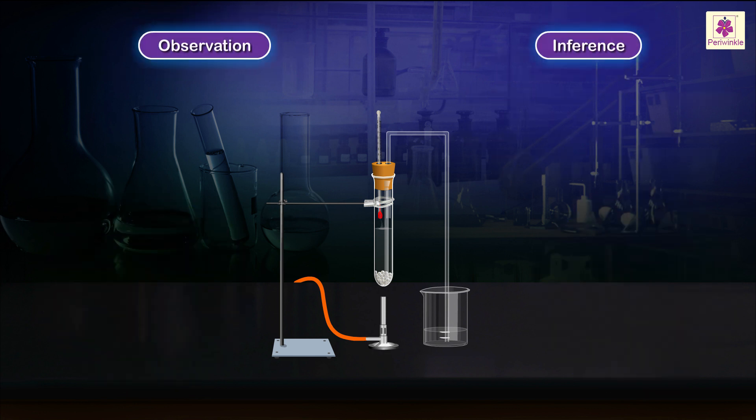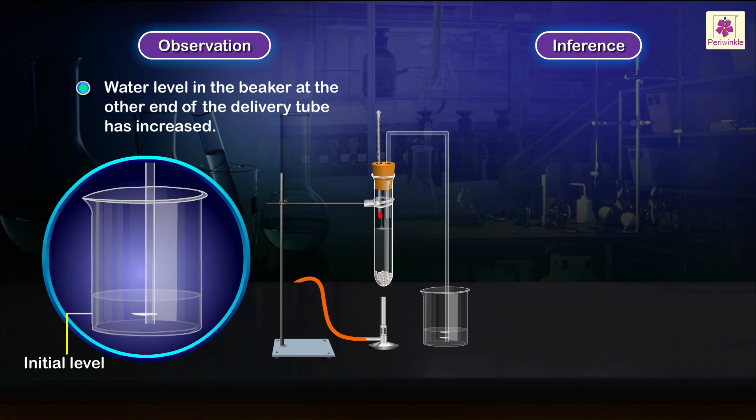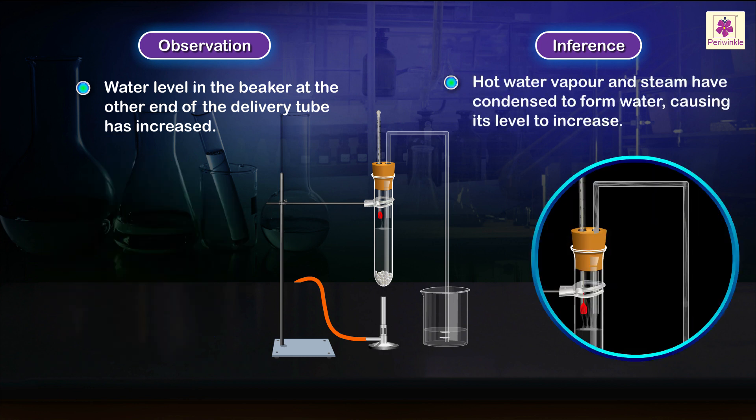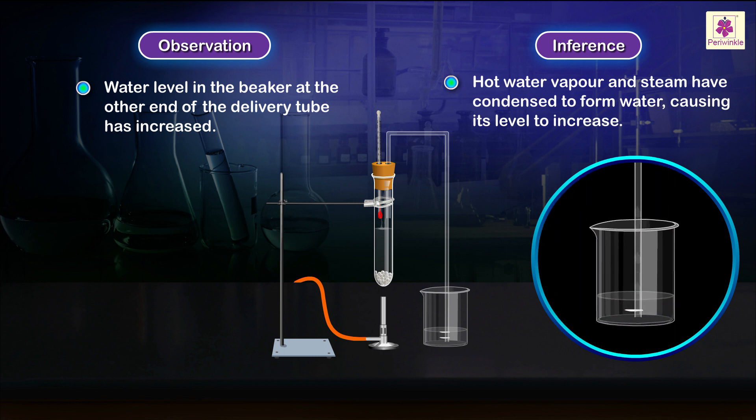Observation and inference. Water level in the beaker at the other end of the delivery tube has increased. Hot water vapor and steam have condensed to form water, causing its level to increase.